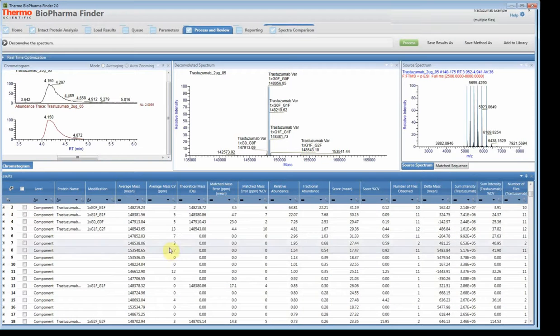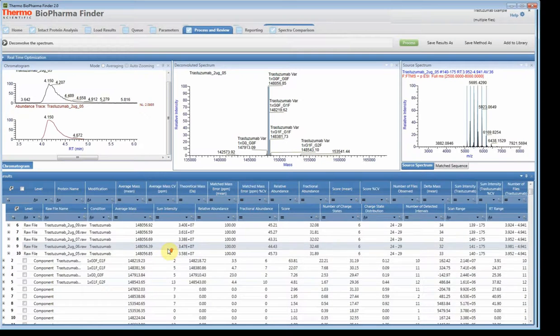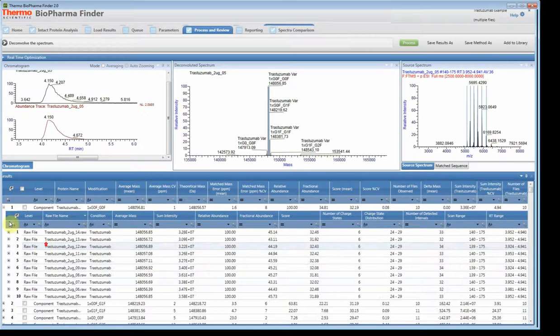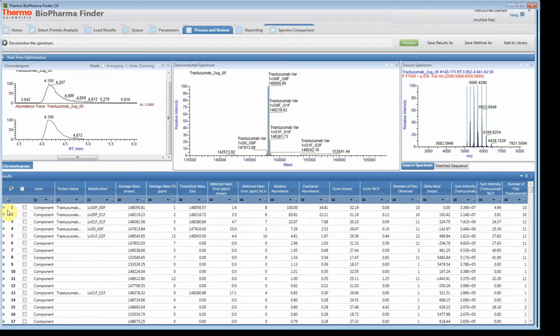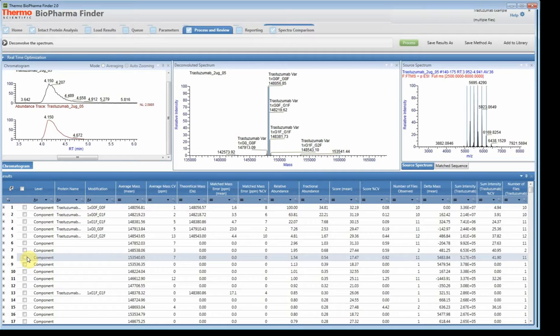I hope this was a good example of how you can process a native dataset. This is a multi-consensus experiment using our Biopharma Finder 2.0 software. Thank you.